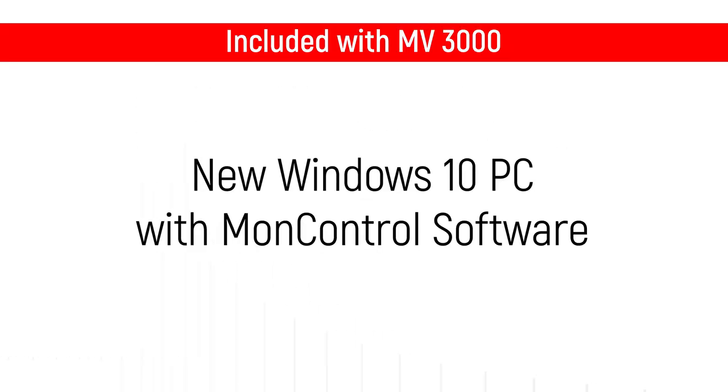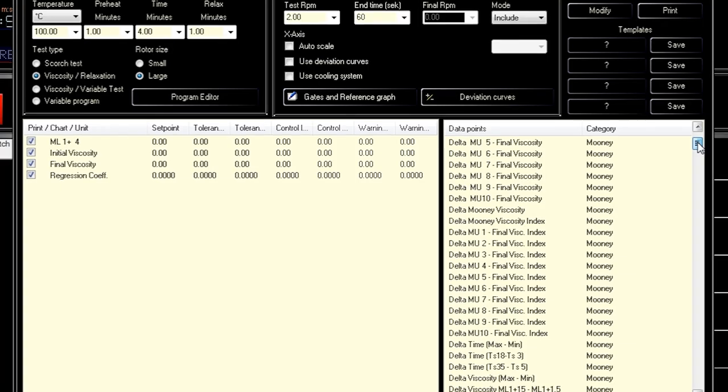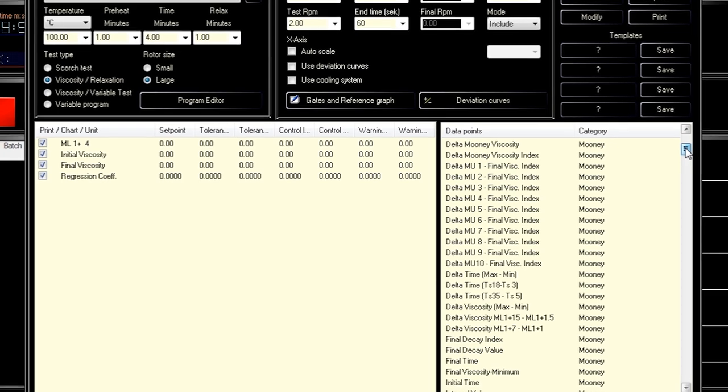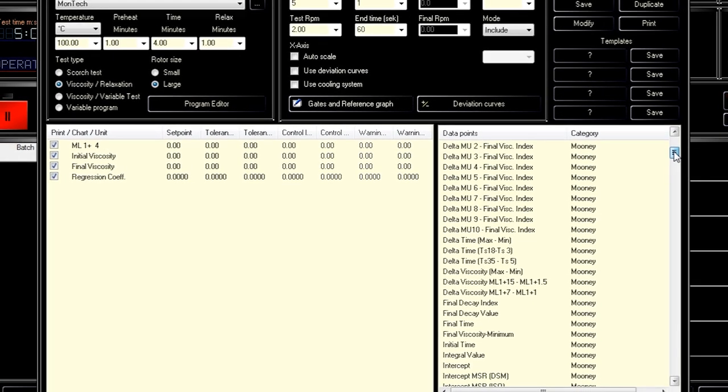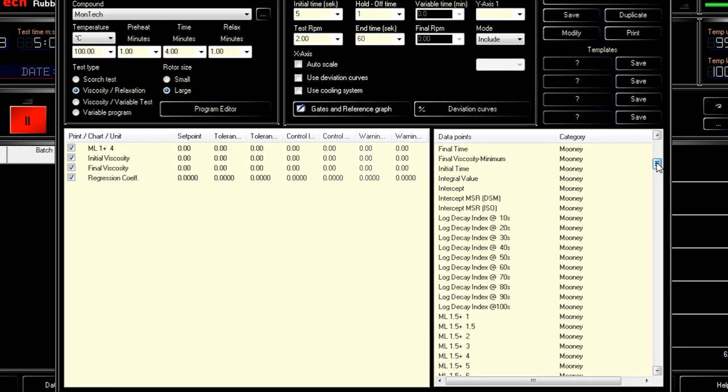The MV3000 comes with a new Windows 10 PC with MonControl software to create and execute test sequences, then record the results. Customizable test parameters are preloaded into MonControl, allowing users to easily select a test and begin testing with the push of a button.